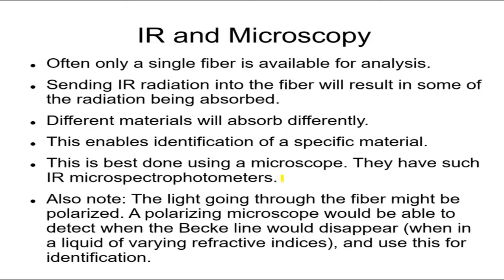For example, there's only one enemy of this person's that bought that shirt. So this person becomes a person of interest. We start to suspect him. Again, these are just things you can do with the IR microspectrophotometer when you know the exact chemical the dye is made of.